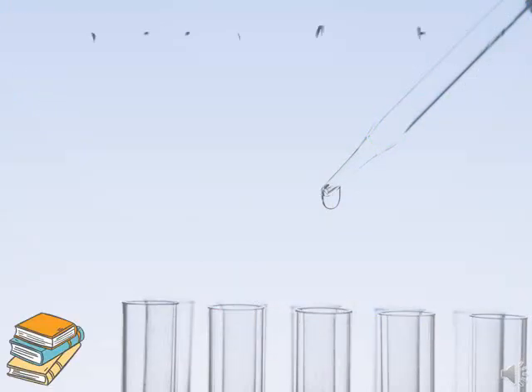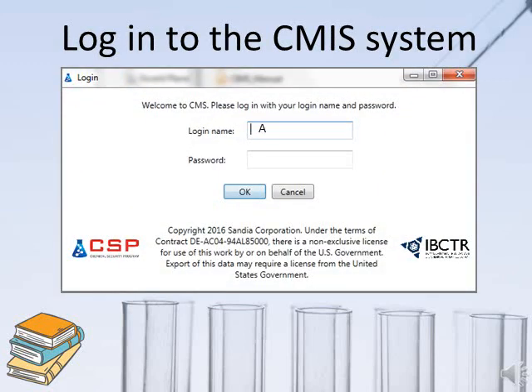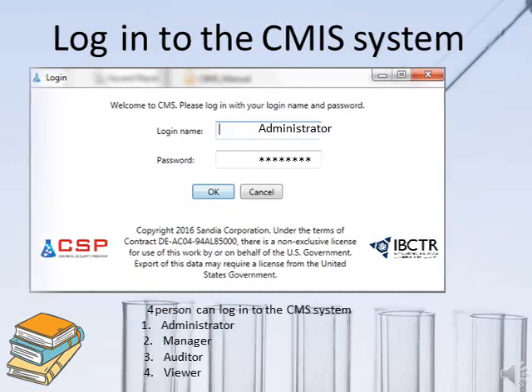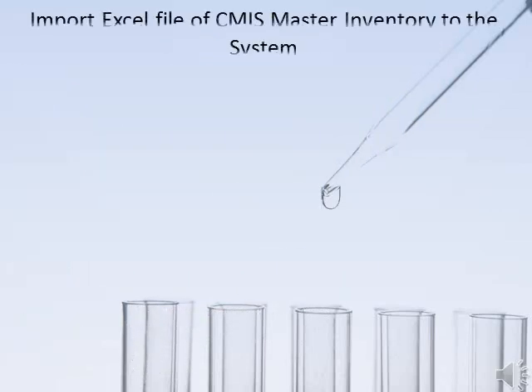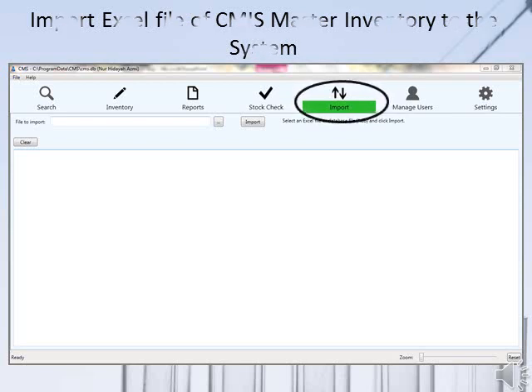After installing the software, log in to the system according to the role assigned by the administrator. As mentioned, there are four roles in the system: administrator, manager, auditor, and viewer. After logging in, the administrator can either manually set up the inventory or import an existing master inventory from a previous Excel file. Only the administrator can perform this part in the CMIS system.